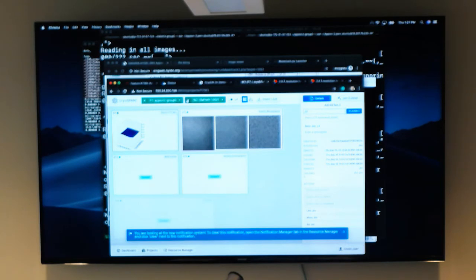I don't know. I would have to look at the dimensions. There's no easy way to see that, this doesn't have a very good interface. We can go into EMPIAR. This uses the 42 gigabyte version. Yeah, I would download that. Meaning in EMPIAR they would annotate the pixel size. So if it's super res, and it's 7,000, we know it's native. If it's 3,000, we know it's not.